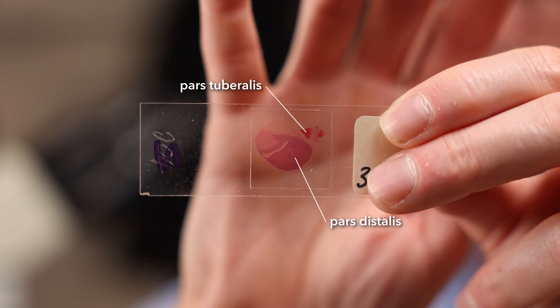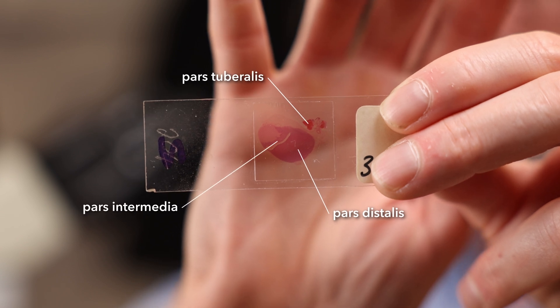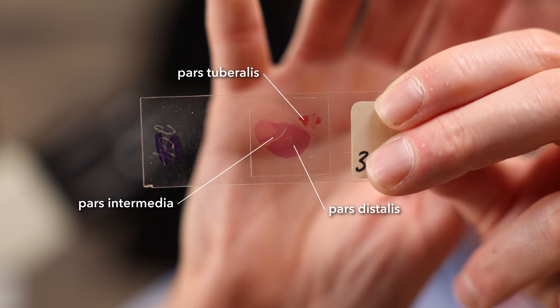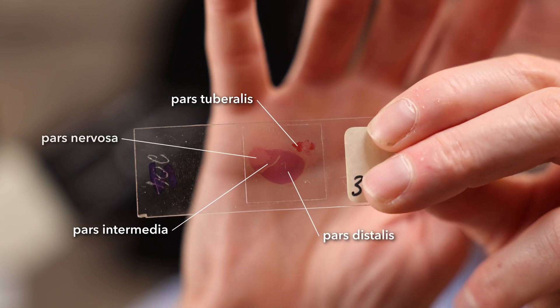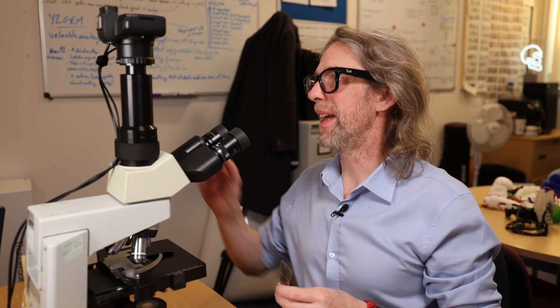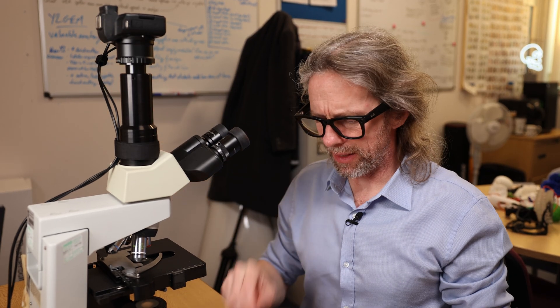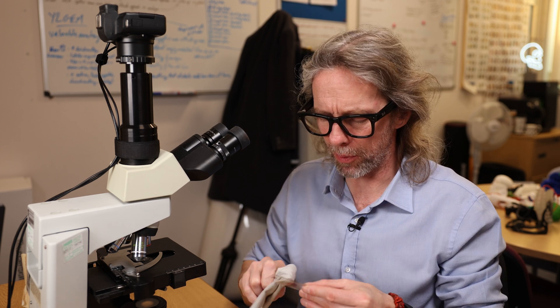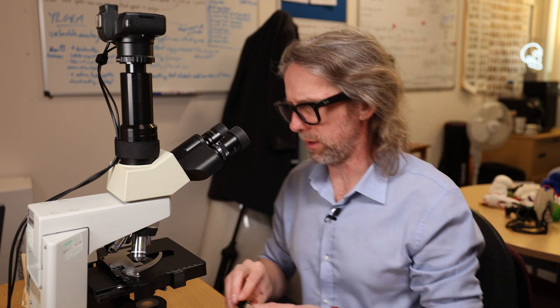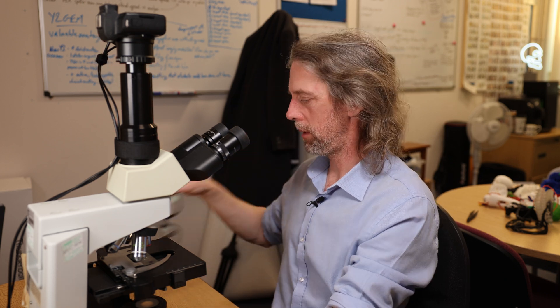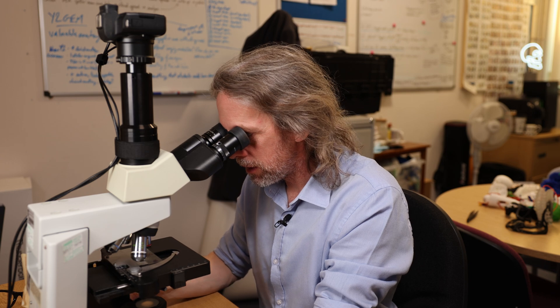There's also the pars intermedia, which is the bit between the anterior and posterior parts, and then the posterior pituitary is called the pars nervosa because it's nervous in nature. The pars distalis and the pars nervosa are the parts we're most interested in. Looking at it just like that, it looks pretty good.